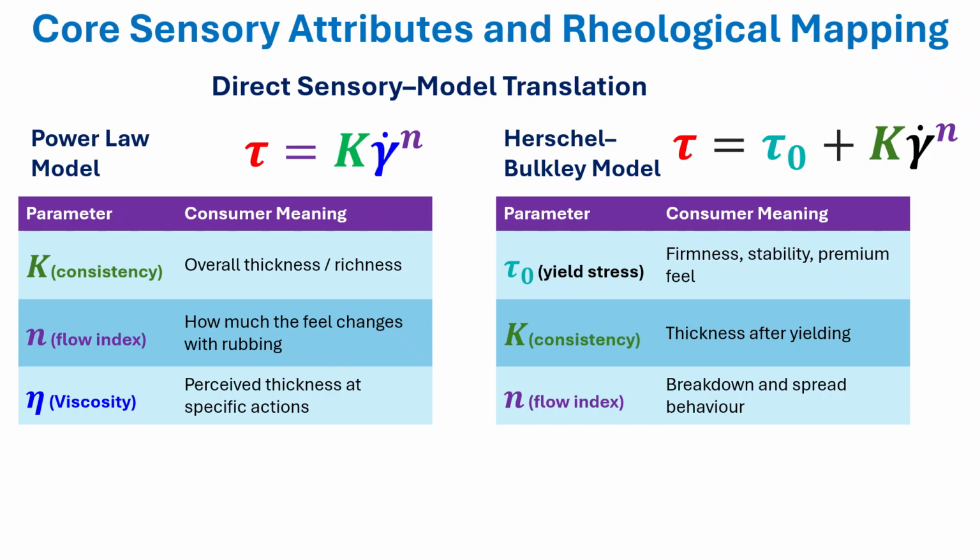Now, as we move to the Herschel-Bulkley model, this gives us an extra layer of understanding because it includes yield stress.